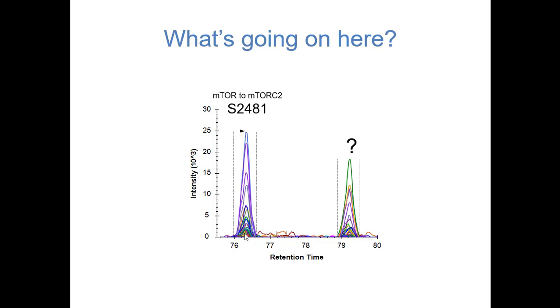Yeah, so definitely resolution is, for example, I think what your question is, if the calibration changes over time, do I end up having peaks come out of the window, of the precursor isolation window? I'm saying the reproducibility of those things, the quantitation. Oh, yeah, yes. So definitely low.